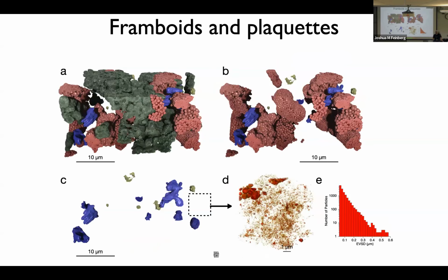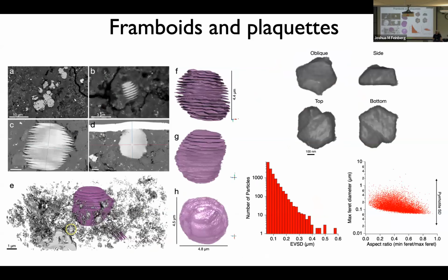So yeah, another pretty picture. More pretty pictures, okay? This one is interesting because we're focusing here actually not on this beautiful plaquette, which is a bit of a distraction, but on the matrix around it, which is filled with pyrrhotite, as we've seen from the EDS. Additional evidence that it's pyrrhotite, we can find this little particle here highlighted in yellow.